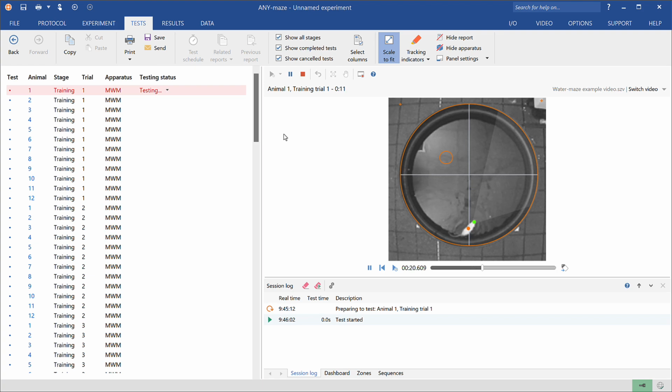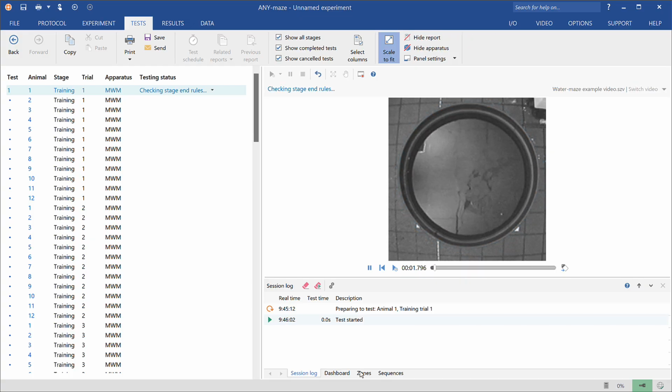Normally, AnyMaze will assess the movement in the entire area outside of the apparatus map, but with WaterMaze Fast Auto Start, it will assess just the sliver immediately surrounding the water maze to engage Auto Start sooner. This is to avoid an instance where it takes you even a second or two to leave the frame, in which time the animal has already swam a considerable distance and maybe even found the platform.